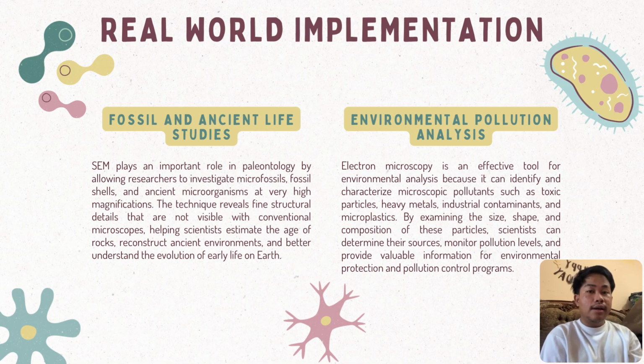Now, let's look at the real-world application of electron microscopy. First, in fossil and ancient life studies, scanning electron microscopy, or SEM, helps scientists examine microfossils and ancient microorganisms in great detail. This allows researchers to reconstruct ancient environments and better understand the evolution of life on Earth.